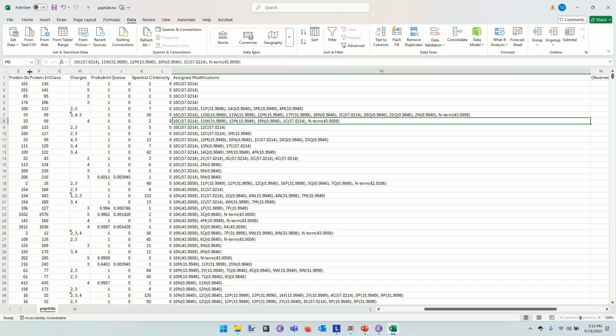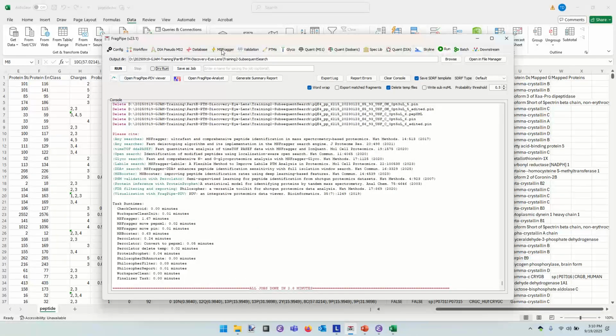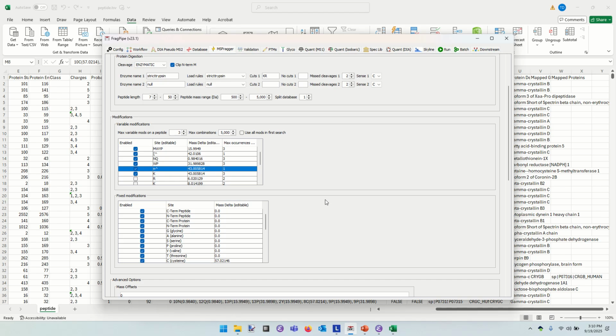The reason is that we have a different limit on each of those PTMs individually. And I don't remember what limit is applied to. I don't remember that there's a limit applied to the peptide in general. Just how many of this PTM are allowed is what we specified. Chris, looking back at our MS Fragger configuration, did we have something where we could set the limit in aggregate?